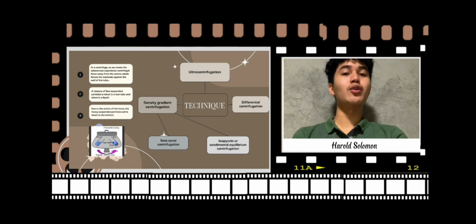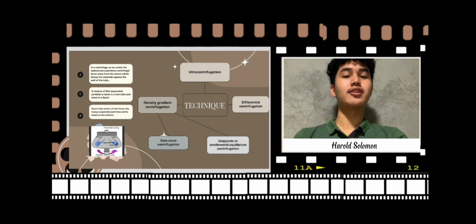Next and last is ultracentrifugation. The first commercial ultracentrifuge was produced in 1940. An important tool in biochemical research is the centrifuge, which through rapid spinning imposes centrifugal forces on suspended particles or even molecules in solution, and causes the separation of such matter on the basis of differences in weight.